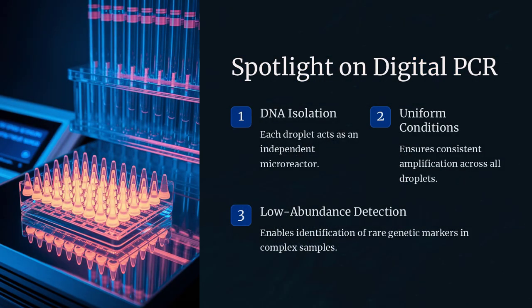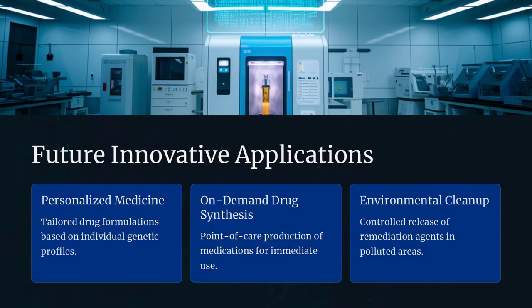One might ask, have you ever observed how water droplets bead on a freshly waxed car? This observation demonstrates that surface properties can dramatically influence fluid behavior, and the answer is that by controlling these surface properties, whether through hydrophobic or hydrophilic treatments, engineers can direct droplets to behave in a predictable manner, ensuring that the system remains stable and effective.